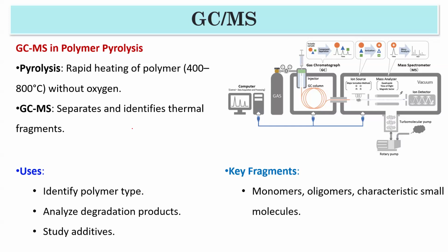You have to have some setup, like an oven, where the polymers are broken down into smaller units, like monomers, and only then should you pass them to the GC column. Otherwise the polymer will just get stuck there, so you should never use it directly.